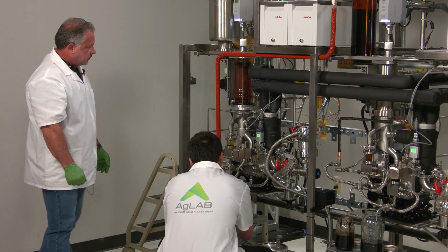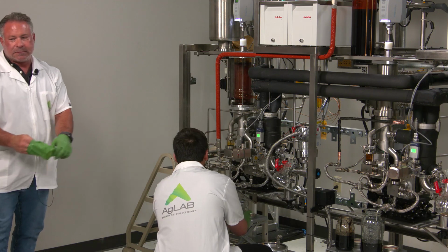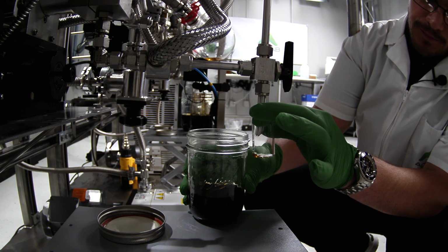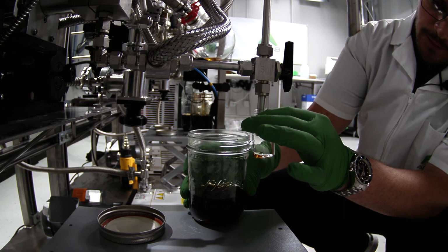All right. Here we go. So I'm going to fill this first distillate sample. I'm going to try to get it to about a quarter of the way up on this 20 ml vial.